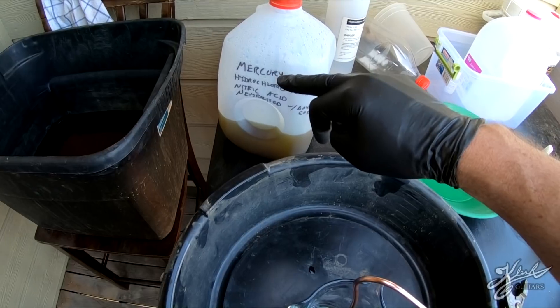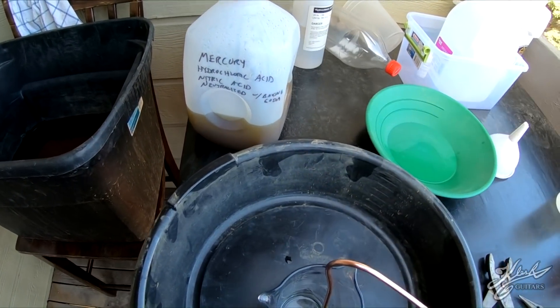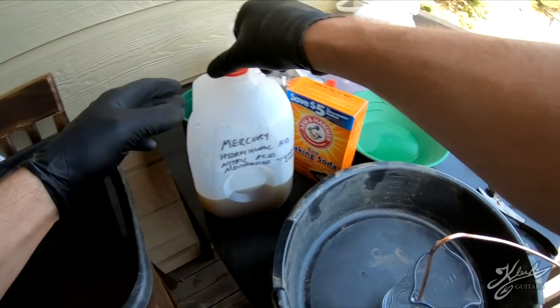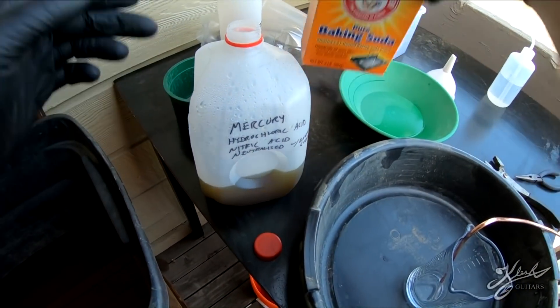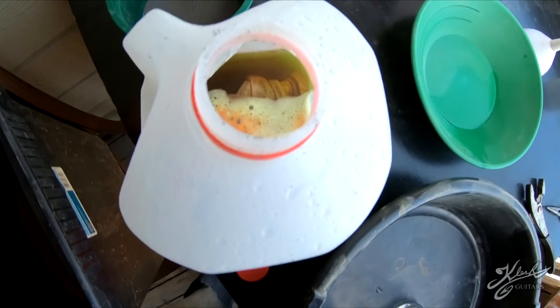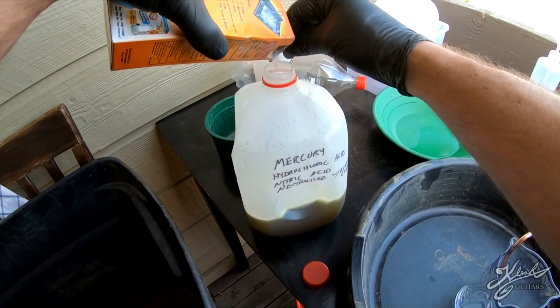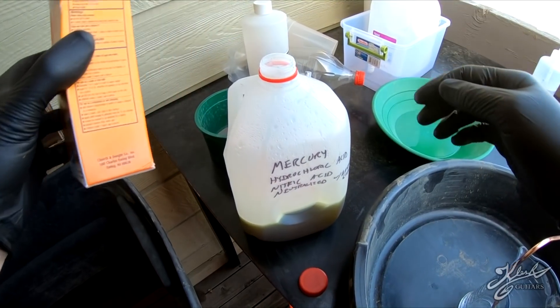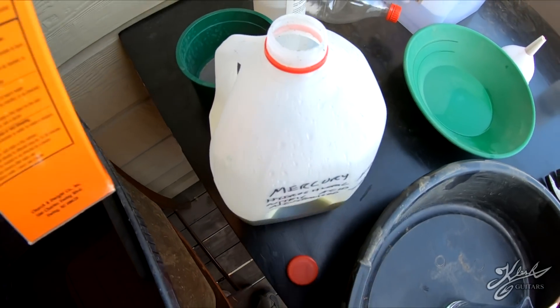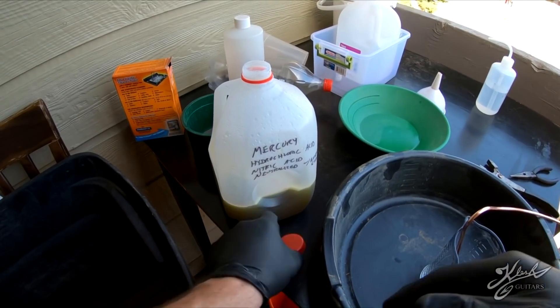Remember to mark the waste container - 'mercury, hydrochloric acid, nitric acid.' I'm actually going to take some baking soda and pour it in there slowly to neutralize the hydrochloric and nitric acid that's in here. You can see it's neutralizing that acid. Do it a little bit at a time and let it go until it stops fizzing, then add a little bit more.